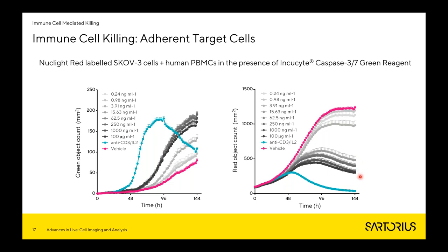And the nice thing about being able to run this assay in an imaging manner is that we're able to continuously image those cells, but we don't have to perform any further manipulations of them. So we can get the data from the image without having to enzymatically treat the cells, take them to, for example, a flow cytometer to perform any downstream analysis.